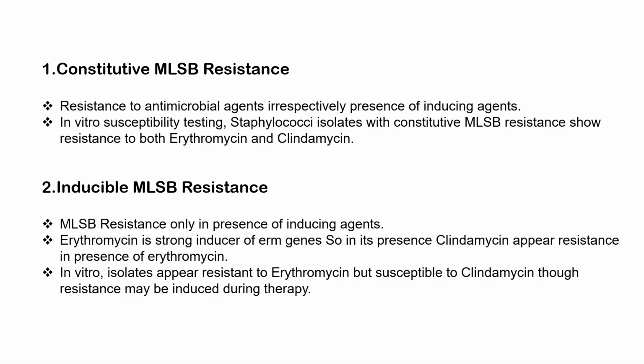The second is inducible MLSB resistance. This is more tricky and clinically important. Resistance appears only in the presence of an inducing agent. Erythromycin acts as a strong inducer of the gene. In laboratory testing, the bacteria may appear resistant to erythromycin, but susceptible to clindamycin. However, during actual treatment, clindamycin resistance can be induced, leading to treatment failure.